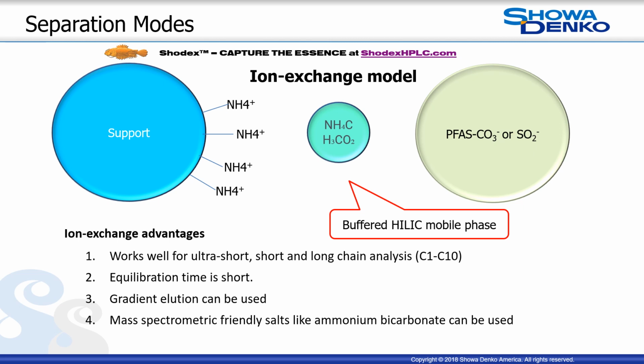Multimodal or mixed mode analysis utilizes a solid support with strong anion exchange functional groups. An ionic buffer and an organic, such as acetonitrile, is added to the mobile phase to regulate the elution of the analytes.